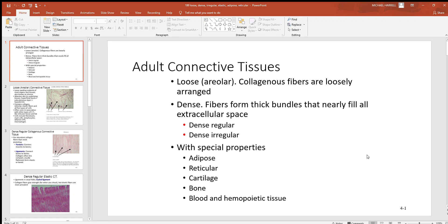Let's continue the discussion with some adult connective tissues. First, we see a loose connective tissue, also called areolar. It's a good name because when you look at a histology slide of this tissue, you can see that all the fibers and cells are very loosely dispersed — there's a whole lot of space in between them, and collagen is a very dominant fiber type. You can also see dense connective tissue, where all the fibers are very tightly packed with very little space in between.